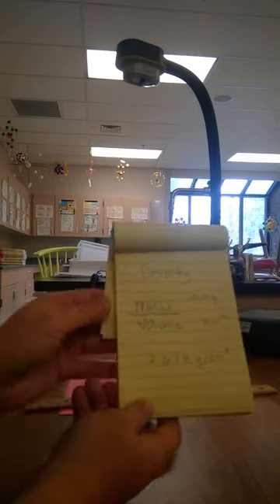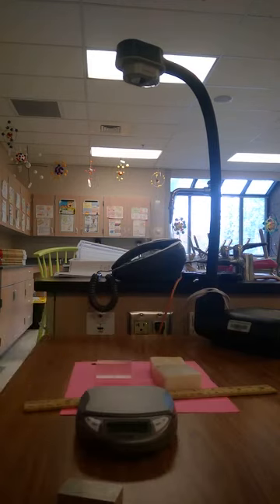So I'm going to go ahead today, and through the video lab, I will help you find the length, the width, the height, and the mass. You'll also need to make sure that you completely fill in the data chart and then answer question 2 and 3 from the worksheet before you submit it. This lab is worth a total of 30 points, so working really hard to have everything finished is important.